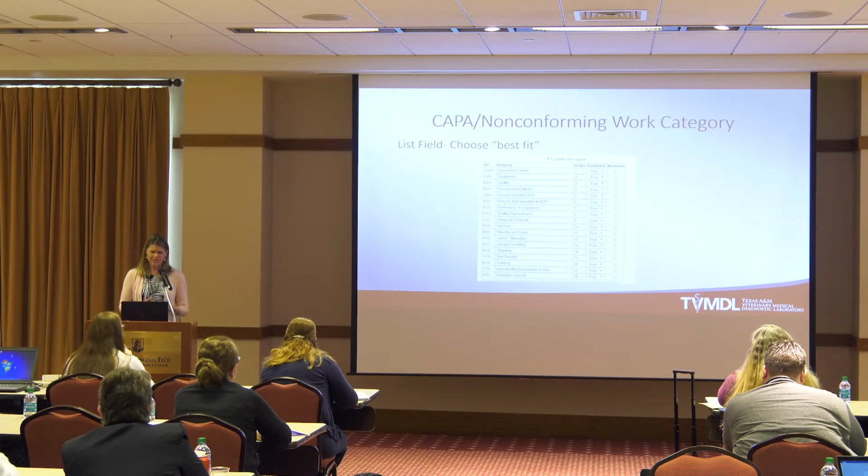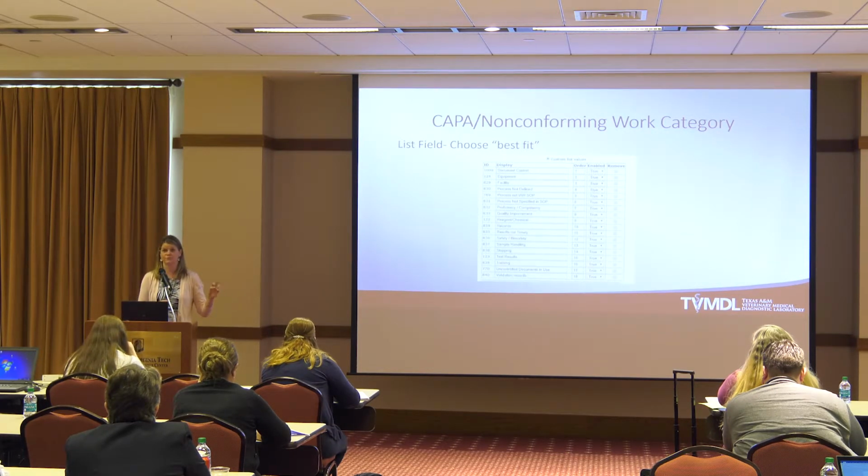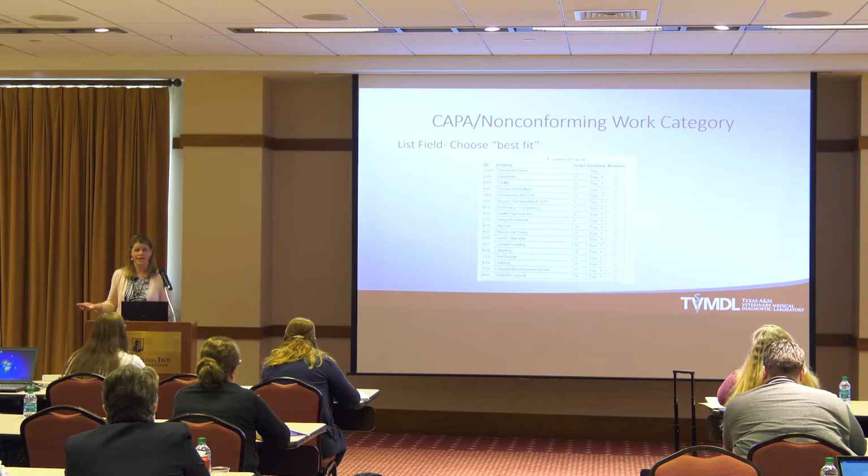But test results can be, if anything went out to the client, there are many examples, but it could just be that you had a wrong ID. So maybe they didn't see at some point that those numbers were transposed early in the process, and then we reported it, and it technically has the wrong case number on your report. So we make them address that.